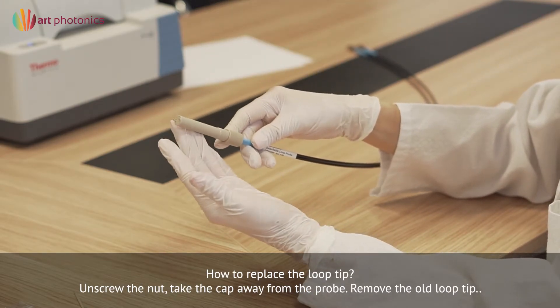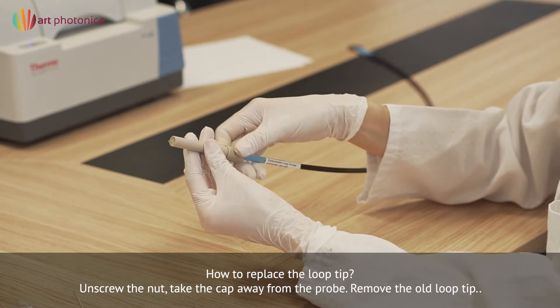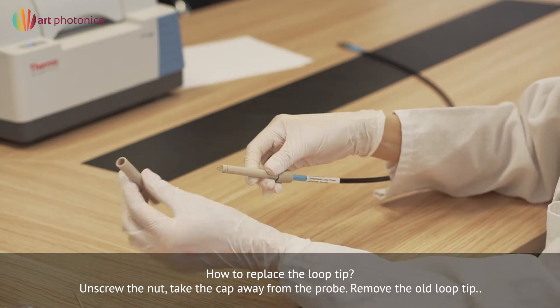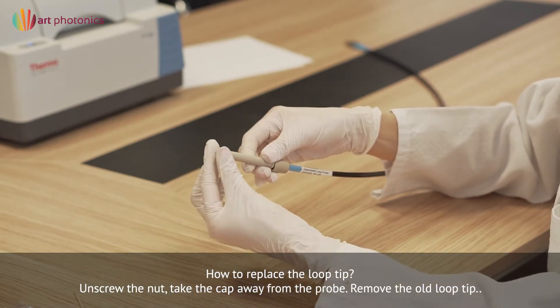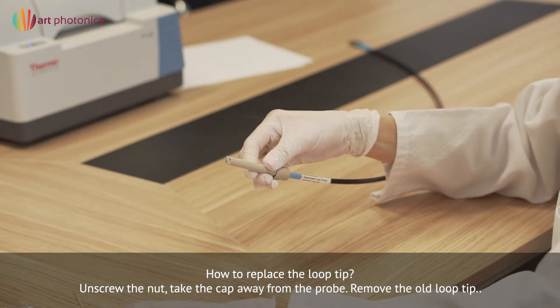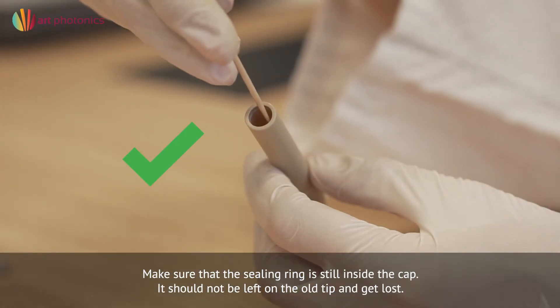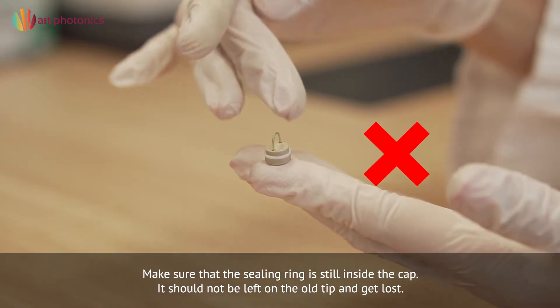How to replace the loop tip: Unscrew the nut and take away the cap from the probe. Remove the old loop tip from the probe shaft. Make sure that the sealing ring is still inside the cap — it should not be left on the old tip and get lost.